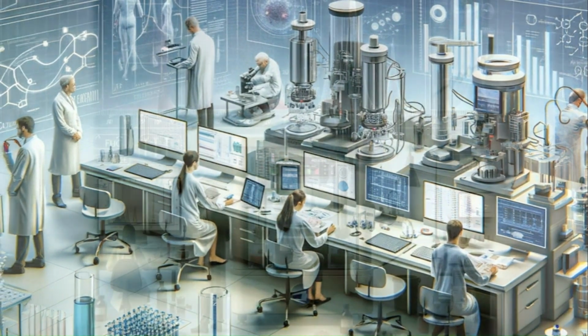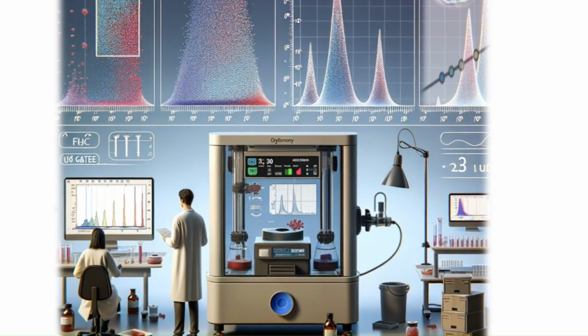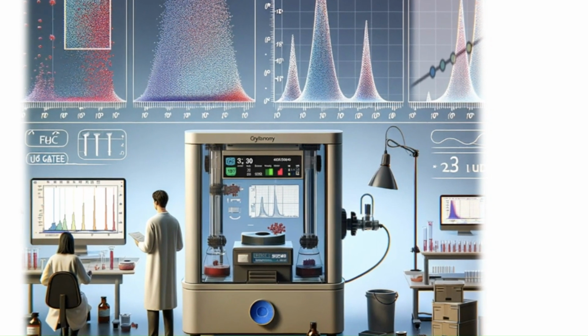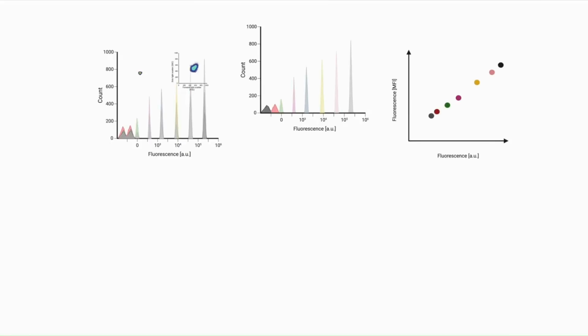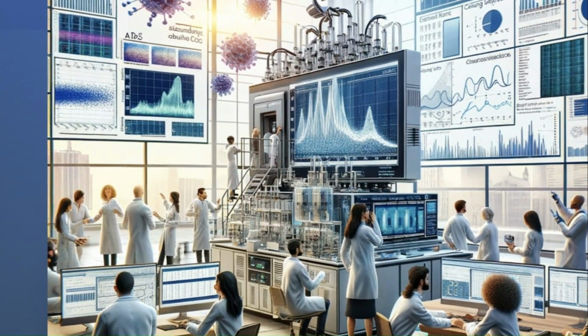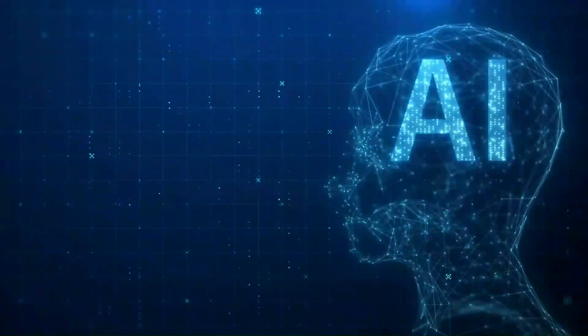single-cell-based clinical trials. Today, instrument standardization involves a range of approaches, some of which haven't changed for decades. Most cytometer manufacturers provide some standardization through automated setup routines. Although these are often not transferable across cytometry platforms, individual users, labs, and facilities often implement their own standardization techniques using calibration particles, reference samples, or other manual approaches based on their assay needs. These techniques can be labor-intensive and difficult to translate across labs or datasets, limiting the potential of cytometry as a data source for the kinds of groundbreaking insights that AI can provide.